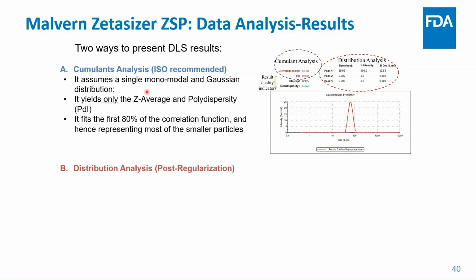It yields a Z average and a polydispersity, which are both very useful, and fundamentally, basically the least amount of treatment or manipulation of the data gives you, in the cumulant analysis, Z average and polydispersity. So those are the most accurate things that a DLS reports. And by accurate, I mean true to the system measurement principles. Let's say that instead of accurate.